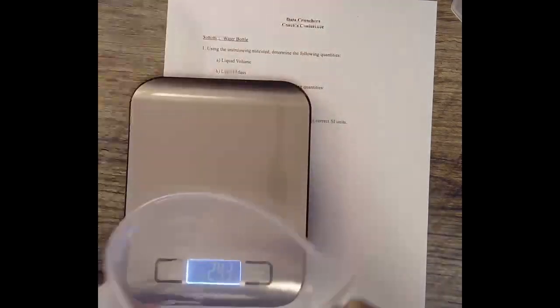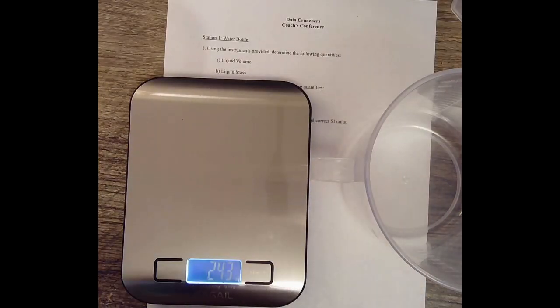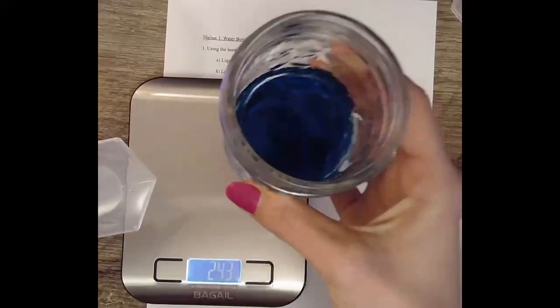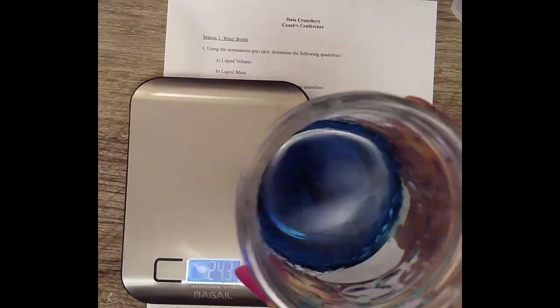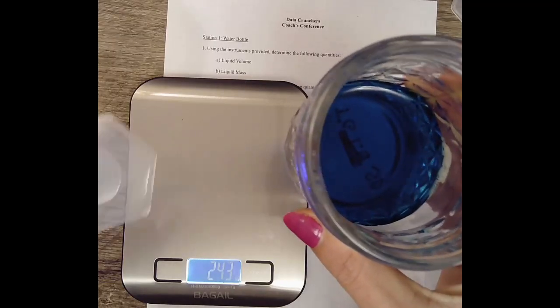You might have a beaker whenever you are in your station. I'm not sure, but for today's station in Miss Lee's class, you are going to have a beaker. Beakers are primarily used for holding and mixing liquids. So if I try to pour this jar of liquid, it has a number 1 on the top. I already took it off. It's my unknown substance. Part of the scientific method is we do not touch our unknown substances. It could be dangerous.